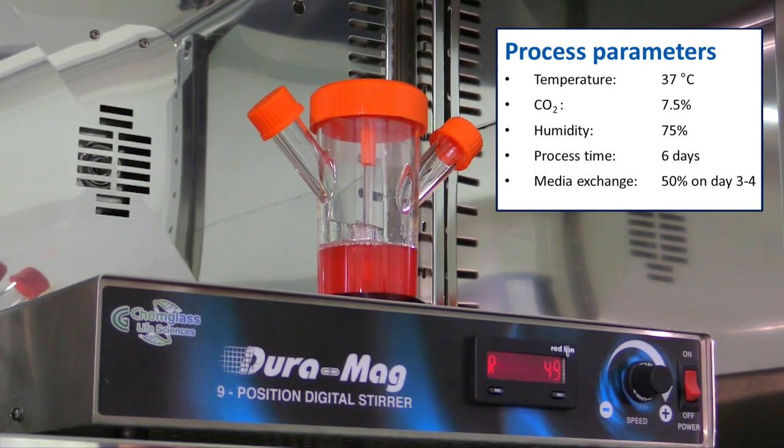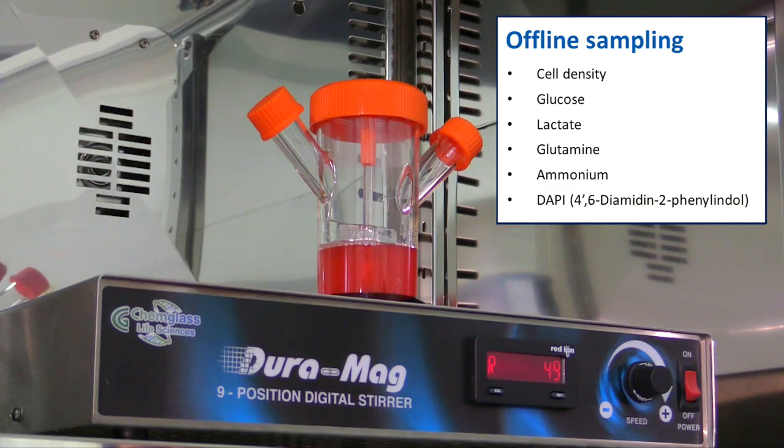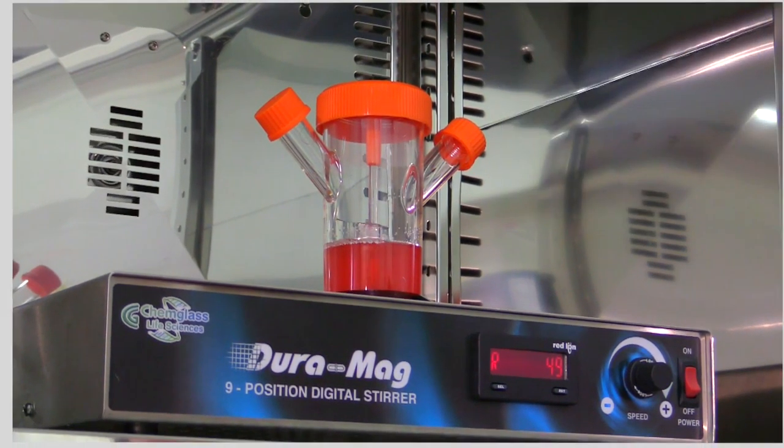When around 2 times 10 to the power of 4 cells per square centimeter are reached, 50% of the culture medium has to be replaced. This is usually between day 3 and 4. Furthermore, it is recommended that offline samples for determination of cell density, concentration of glucose, lactate, glutamine and ammonia, as well as for DAPI staining, are taken daily.